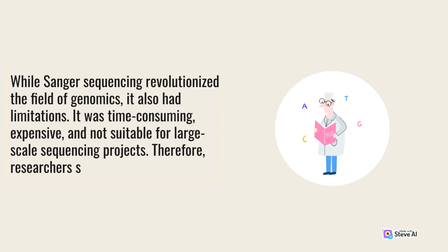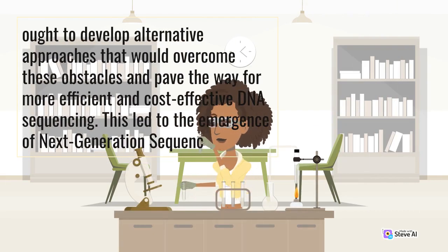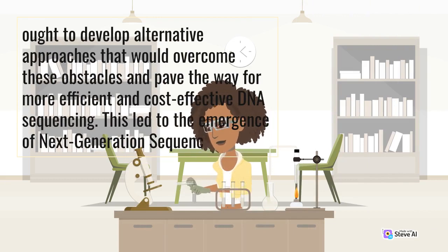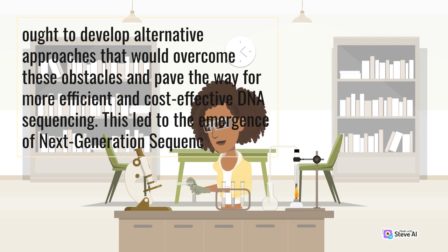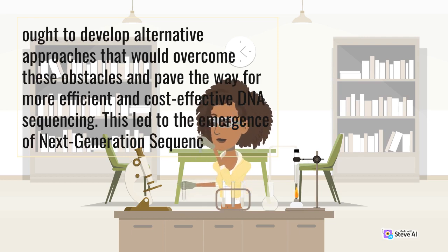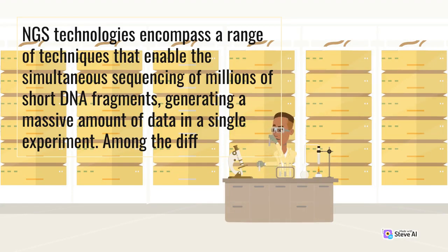Therefore, researchers sought to develop alternative approaches that would overcome these obstacles and pave the way for more efficient and cost-effective DNA sequencing. This led to the emergence of next-generation sequencing, NGS technologies. NGS technologies encompass a range of techniques that enable the simultaneous sequencing of millions of short DNA fragments, generating a massive amount of data in a single experiment.